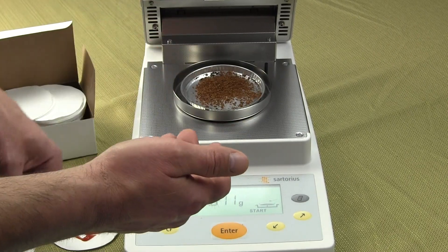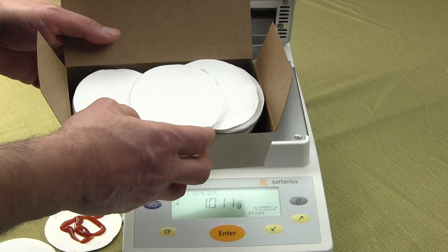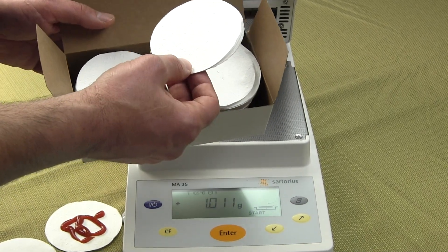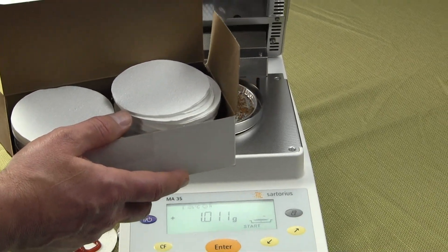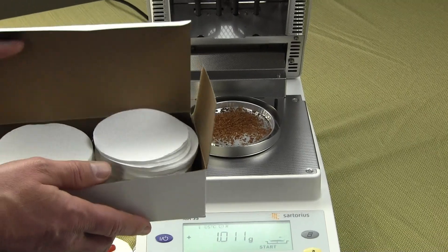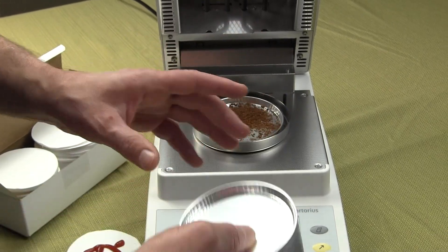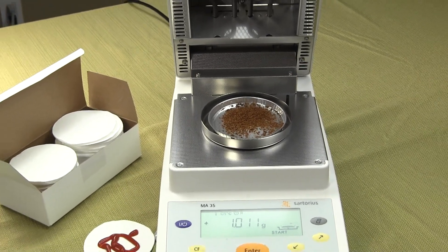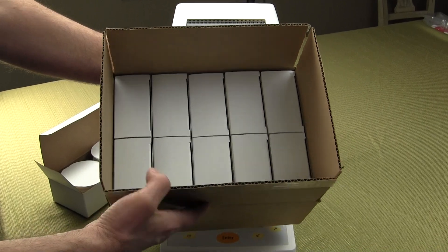The filter pads come 200 to a box or you can buy a case of 4,000. You should use them anytime you have a sample that's going to spatter — if you open the lid of your moisture balance and see foreign material on the inside of the lid, you're going to need filter pads. The aluminum pans come 50 per box, and you can purchase them by the case — a case contains 10 boxes of 50, for 500 pans total.